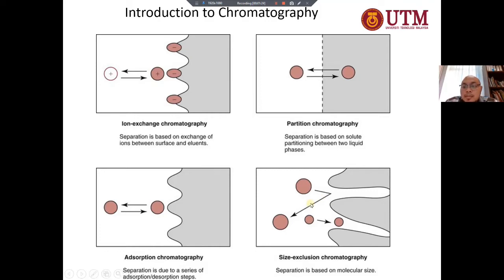If you ask me which one is better, it depends on the application. It's not necessarily that one is better compared to the others. For example, ion exchange is only for ionic compounds, and it is not useful for analysis of non-ionic compounds.